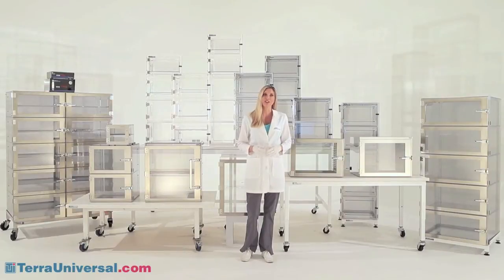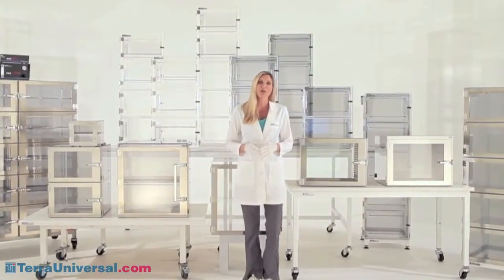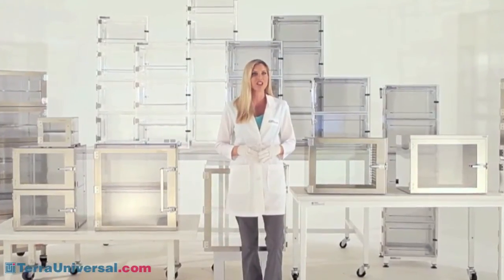Terra Universal desiccators provide a controlled low humidity environment for storing moisture-sensitive parts. These cabinets provide a continuous purge of dry nitrogen that displaces moisture-laden air. Desiccator storage reduces part defects, extends shelf-lives, and increases yields. This video focuses on the range of desiccator cabinets that Terra manufactures. Visit TerraUniversal.com for other information on desiccator storage, including videos on desiccator control systems, installation, and operation.